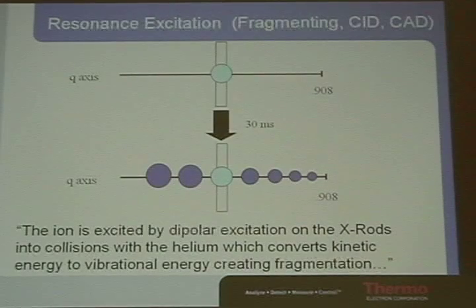Now we're going to fragment the ion of interest. This is fragmentation, resonance excitation. If you got your PhD on the West Coast, it's collisionally induced dissociation. If you got your PhD in mass spec on the East Coast, it's collisionally activated dissociation. If you work for Thermo, it's called the tickle voltage.